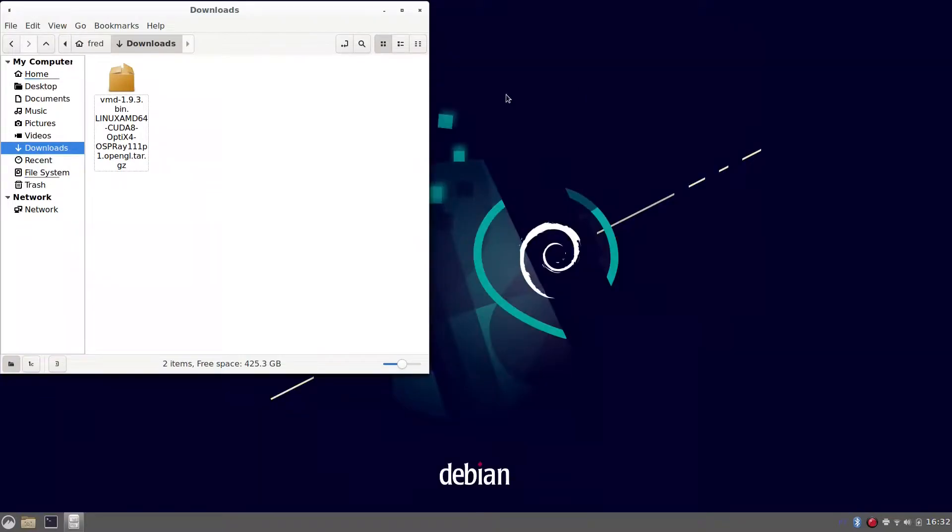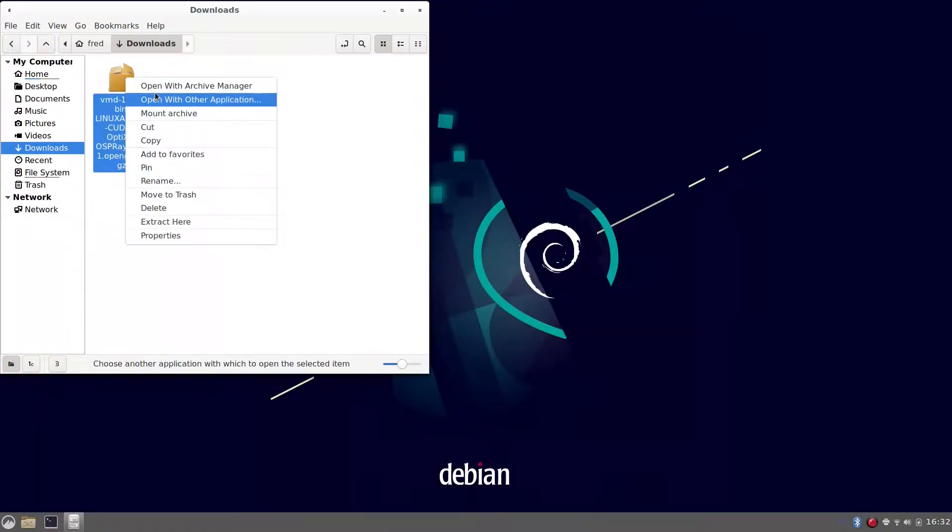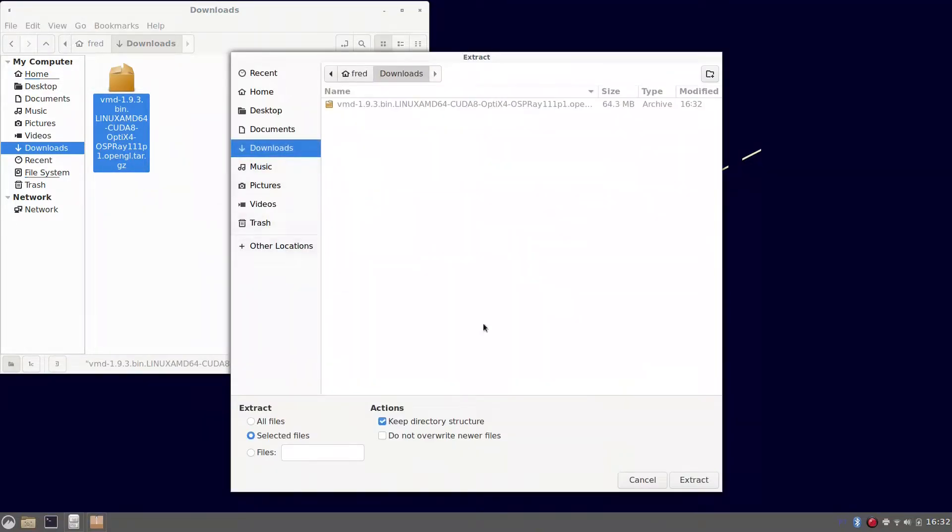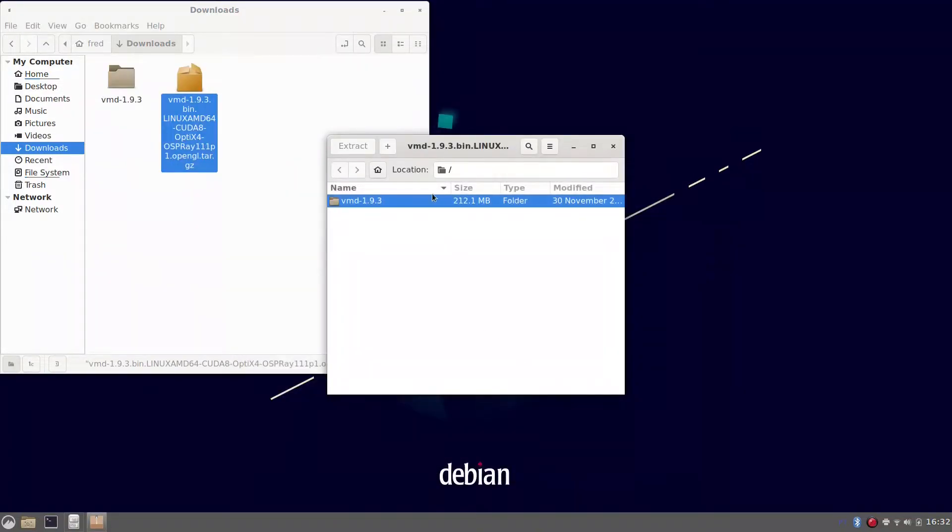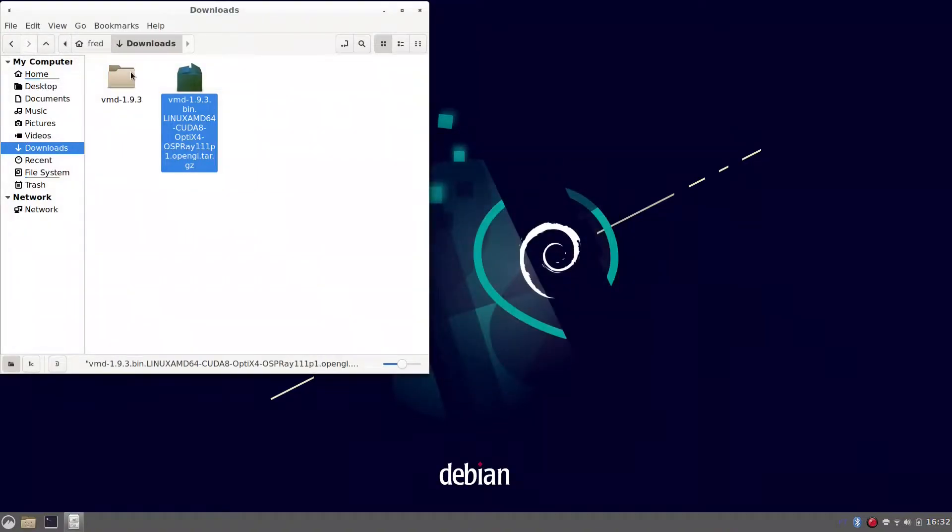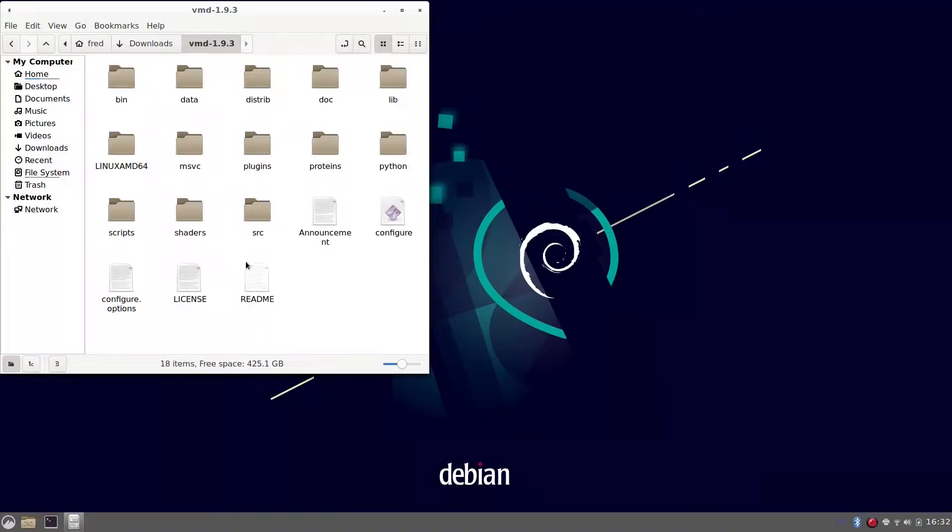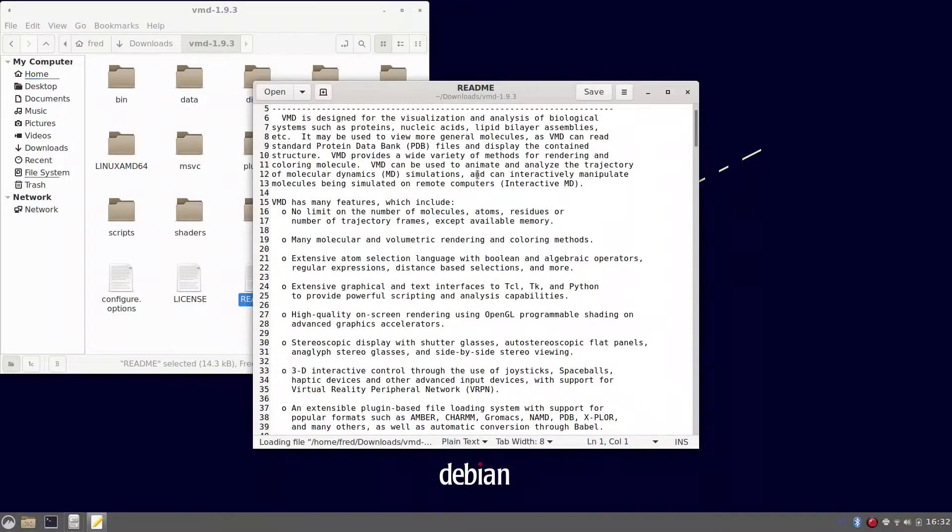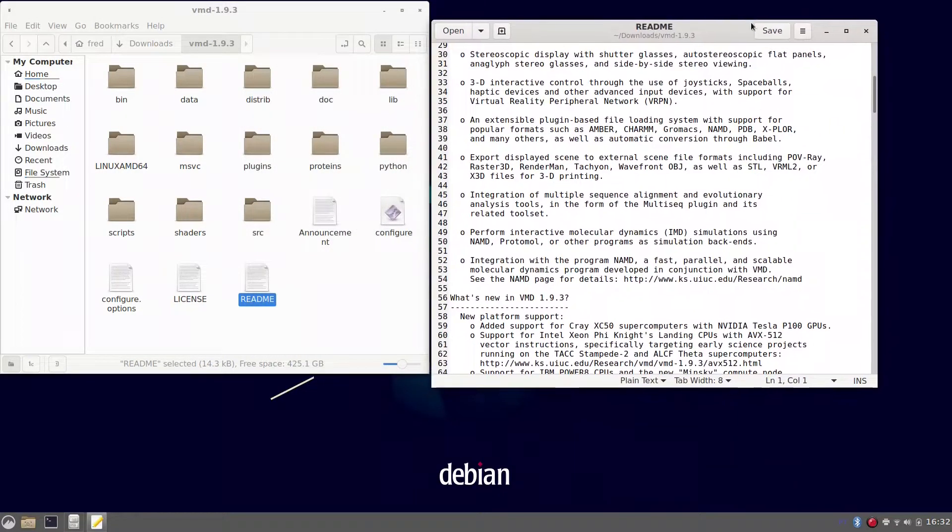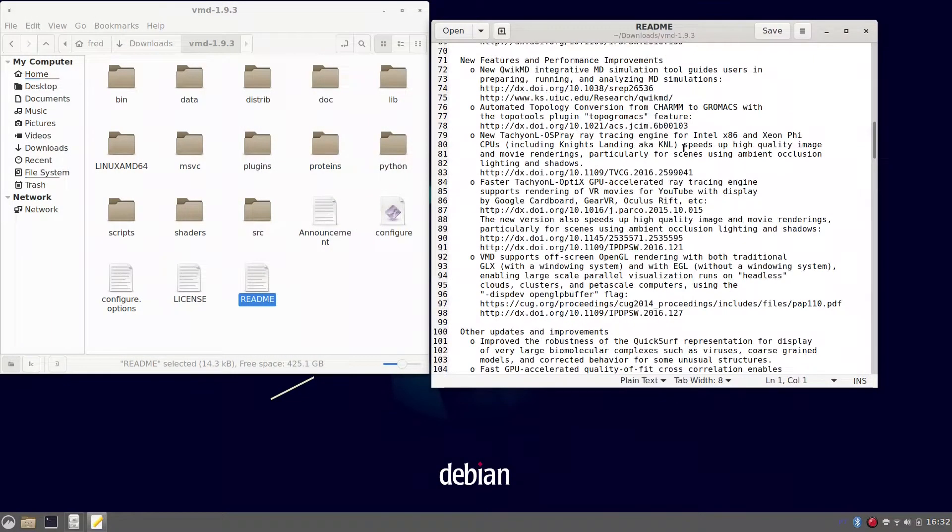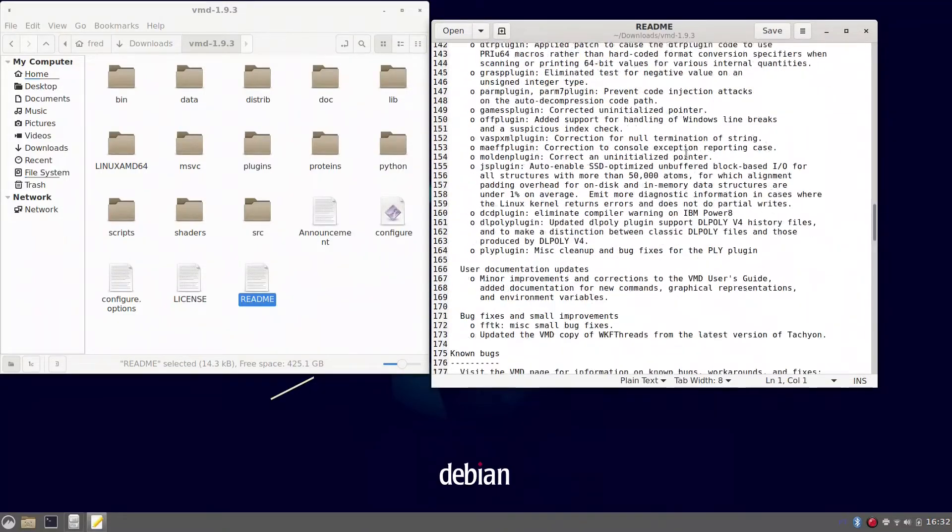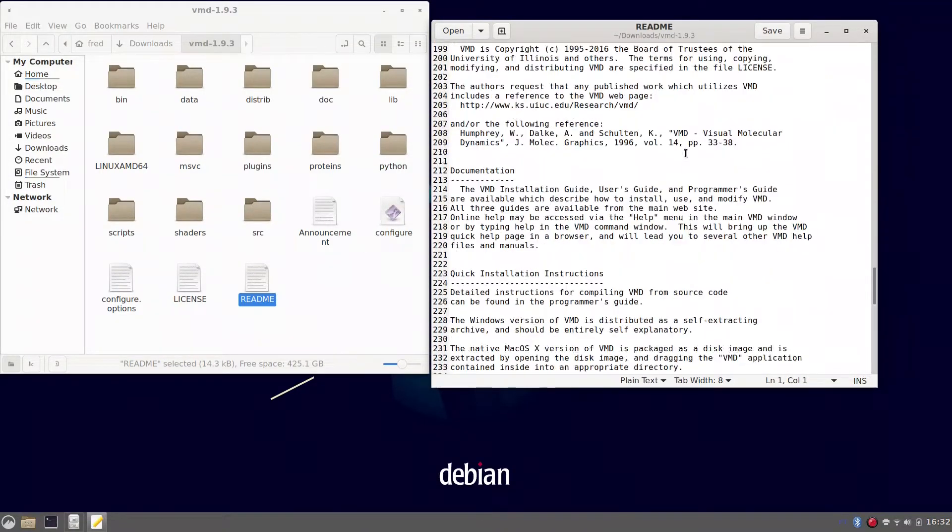Now we can go. You can extract using the graphical application or through the command line, both will work. And also in the readme file, here inside the extracted folder, you can get the next steps to proceed to the standard installation. That's what we are going to do in this video.